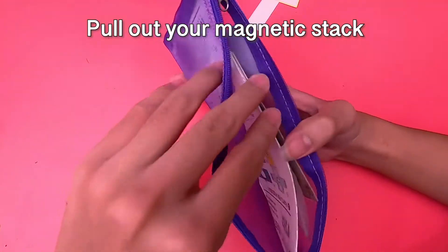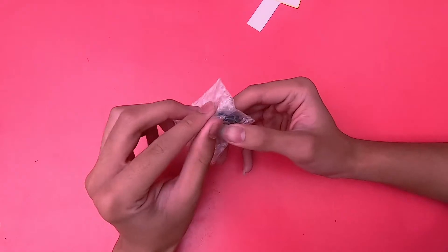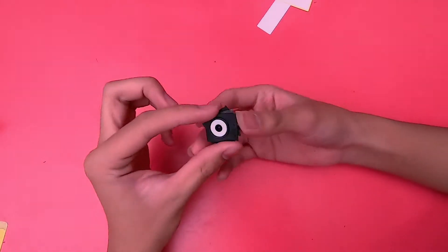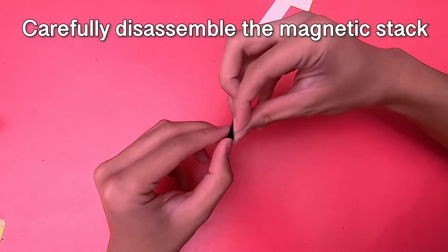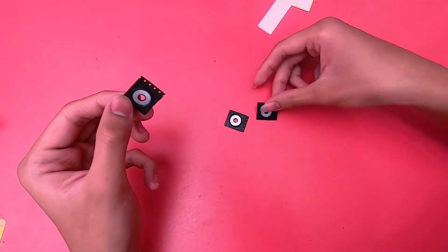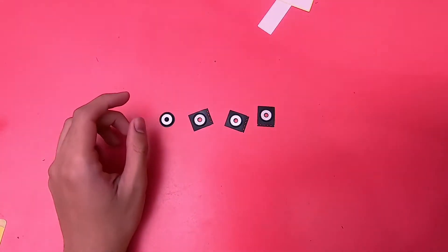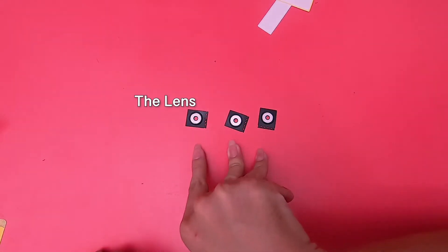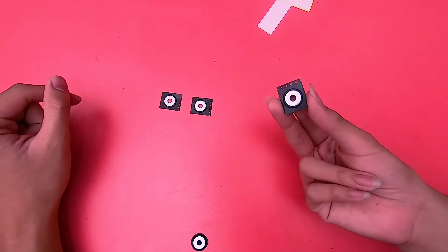Now, I want you to pull out your magnetic stack. The circular lens is what you'll look through. The three rectangular couplers has one for the front, the back, and for your phone. For now, we're going to set aside the one for your phone.